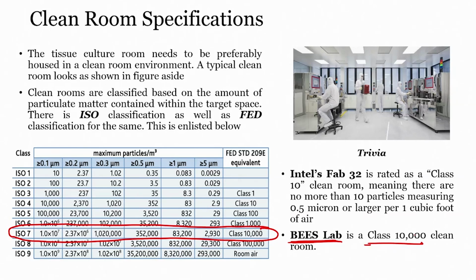And like I said, we are in the process of developing another laboratory with cell culture as well as a microfabrication facility, which will be class 1000 clean room. But for this lecture and course, we will be understanding class 10,000, and we will be looking at class 10,000 in reality, and what kind of equipment there is within the class 10,000 clean room environment, right.